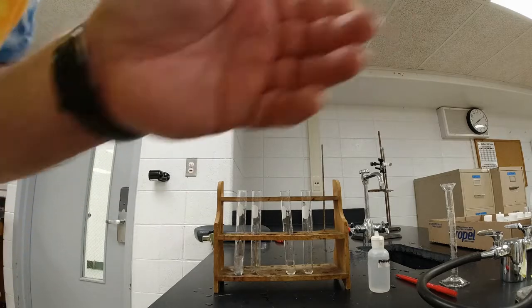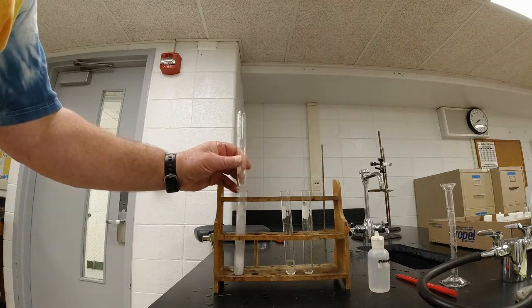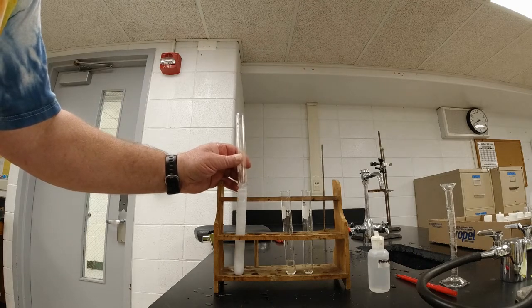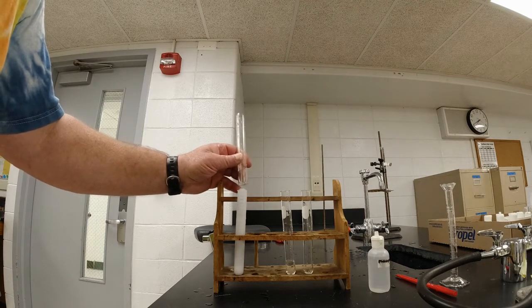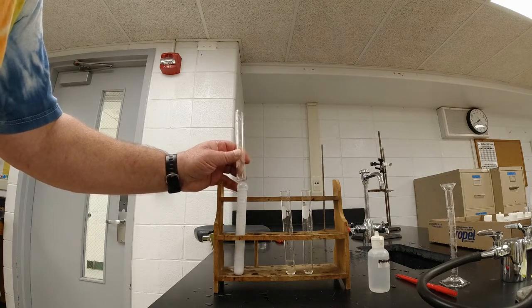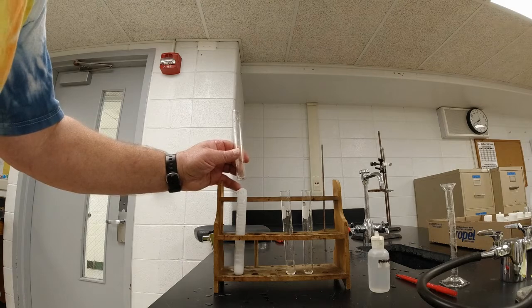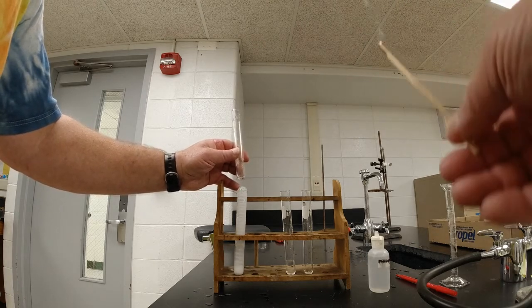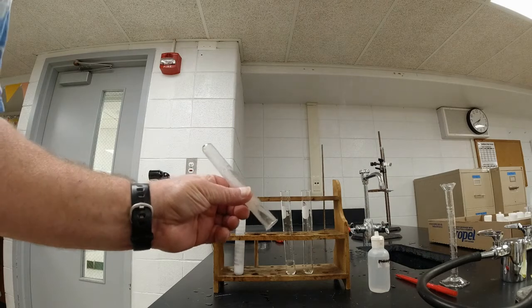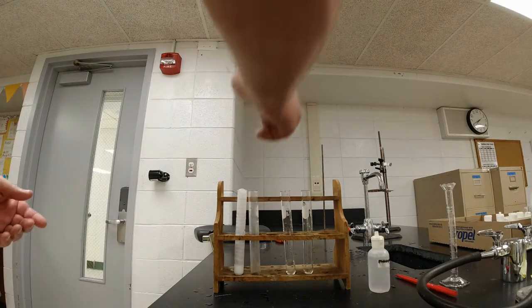So I put it in there. Immediately it starts to fizz, so I'm putting this thing over the top, and I'm trying to catch all the gas that's coming out of that. You can see it's bubbling up. There are lots and lots of bubbles coming out of that thing. I'm going to wait till it slows down a little bit. All right, I got my wood splint burning here. Let's see what happens. All right, I got an explosion that happened there. So the gas exploded. That tells me that that's hydrogen.